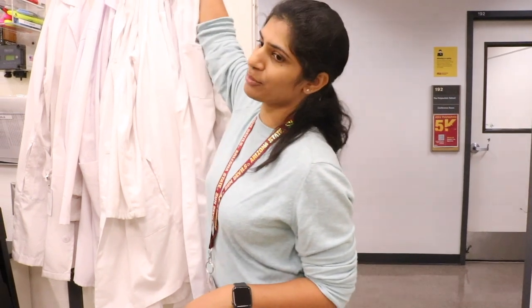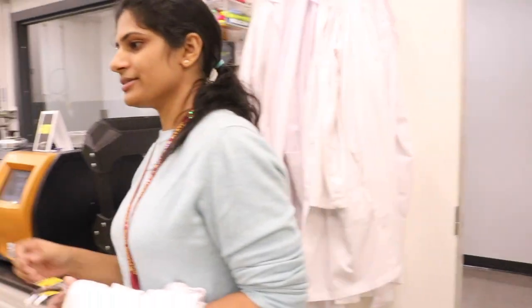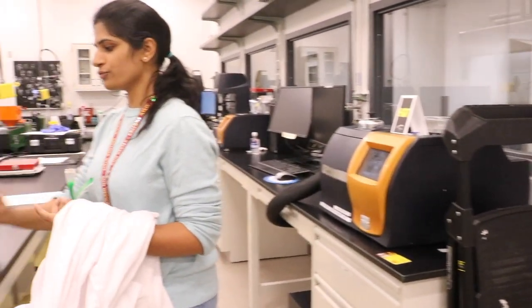The first thing we do as soon as we enter the lab is to take a lab coat, a safety goggle, and a pair of gloves of our size.